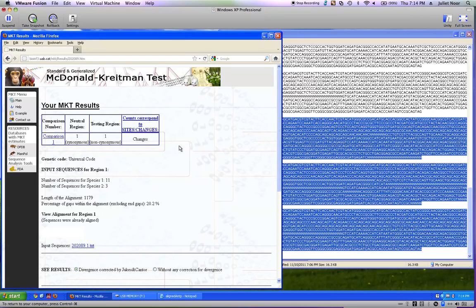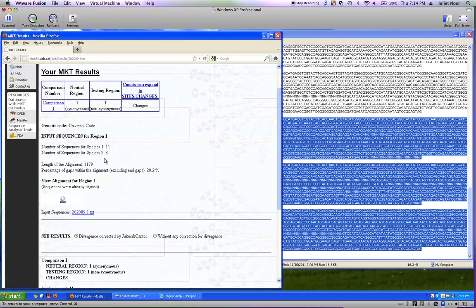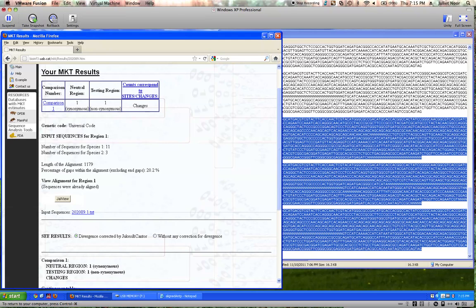After a moment, here are our results — that didn't take too long. There's some information you need to record up at the top, just so we know what was compared: the number of pseudo-obscura sequences, the number of Miranda sequences, and the length of the alignment. A new piece of information here is the percent of nucleotides skipped because they were ends or deletions — in total, 20.2% of the whole sequence length was skipped. Write that down.